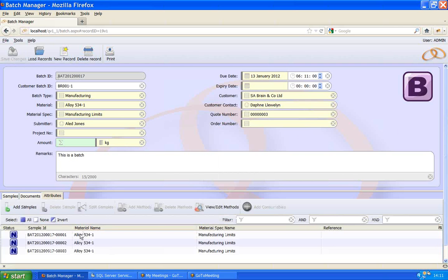As these samples get processed through the sample results input routines, as they're entered and validated and approved, these batches can change to reflect the workflow logic that a business has. And really, that is the batch manager. There is some additional functionality down here about splitting samples. We're going to do that in the next class, take you through that aspect of the batch program.